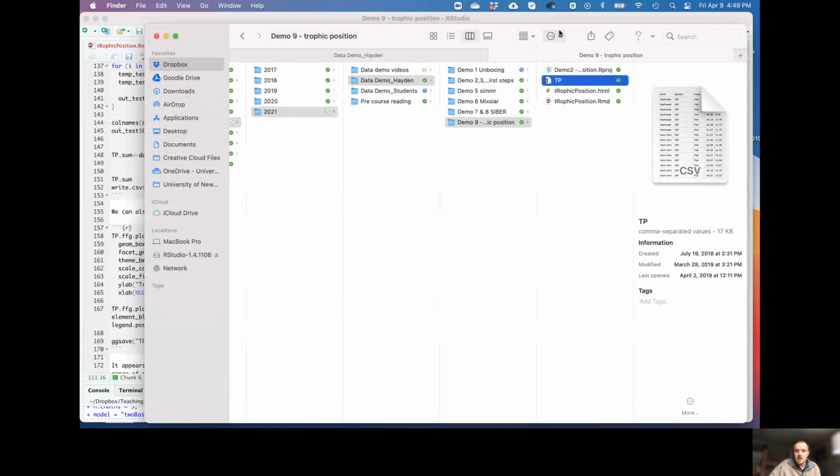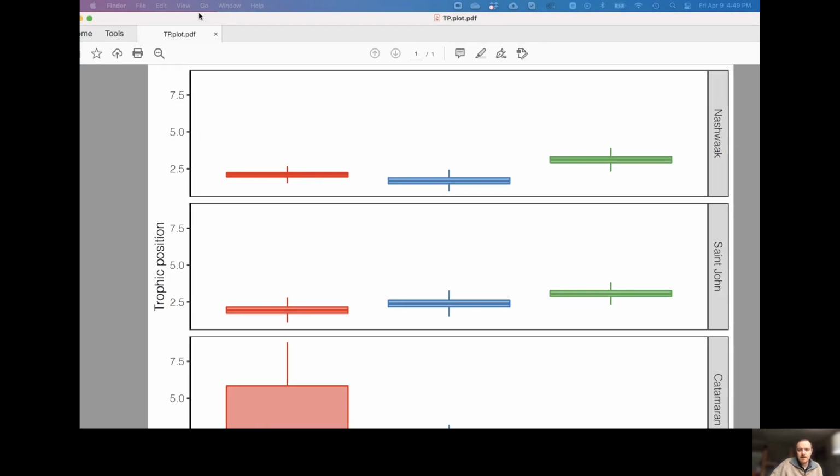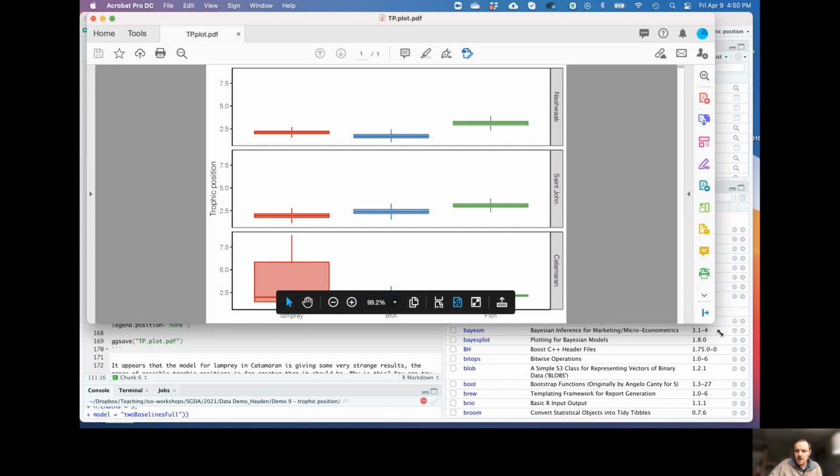Because this is still churning away in the background, I'm just going to show you one we made earlier. Okay, bear with me for one moment. I promise you I can see it and you will see it soon too. Okay, here is that TP plot. Just give it a moment to scale it and make sure it looks neat and tidy.